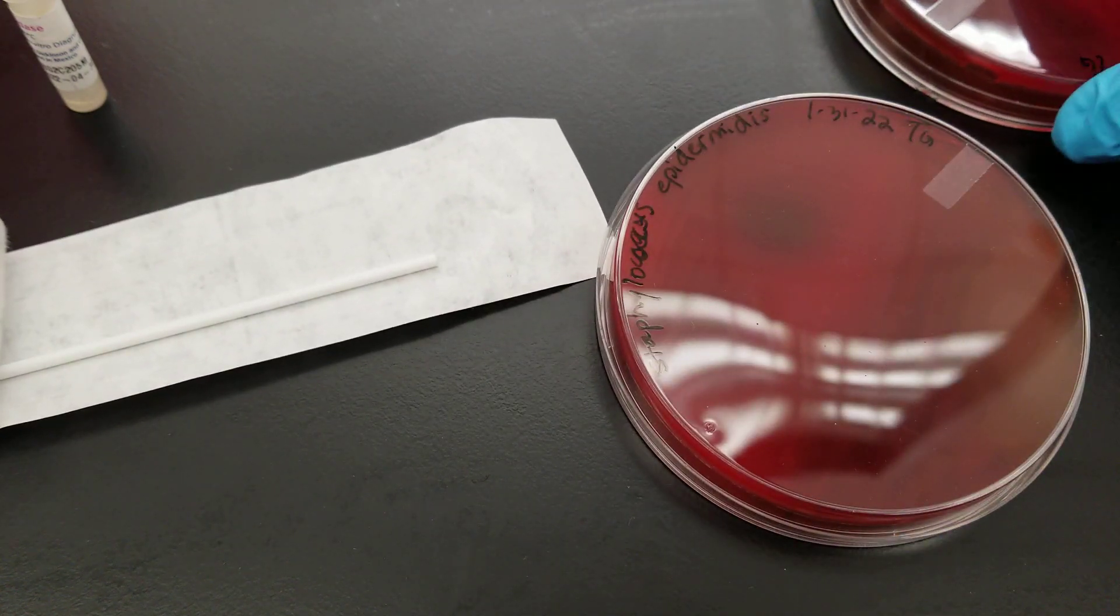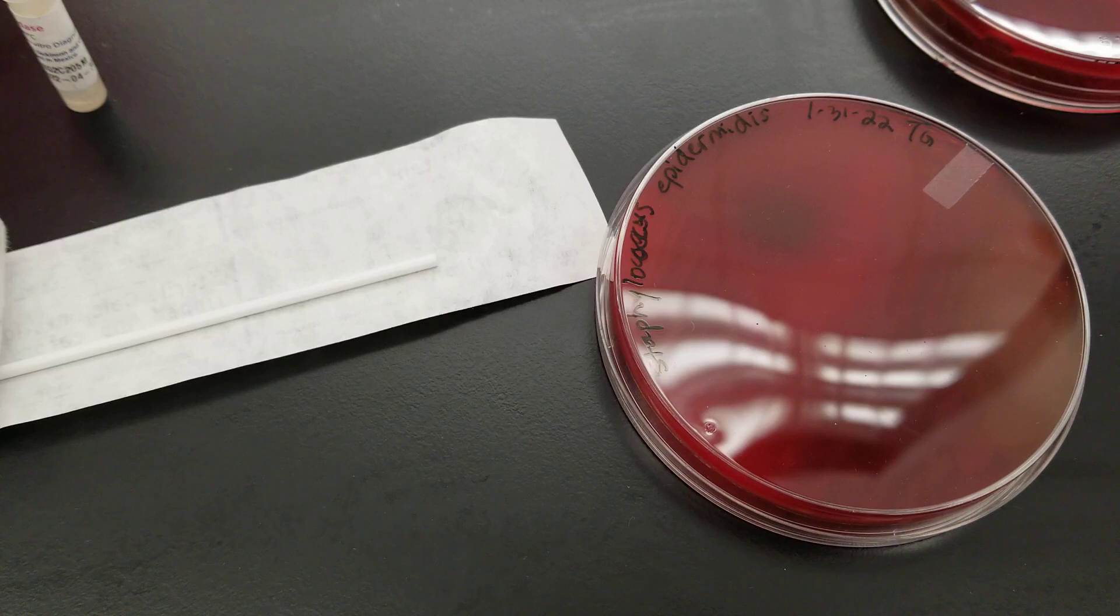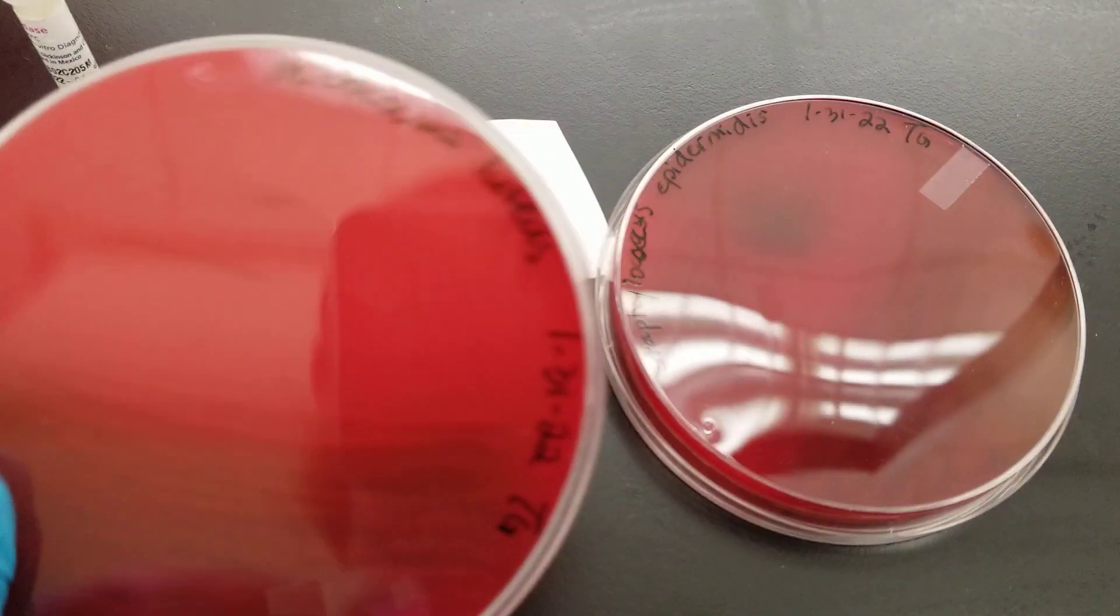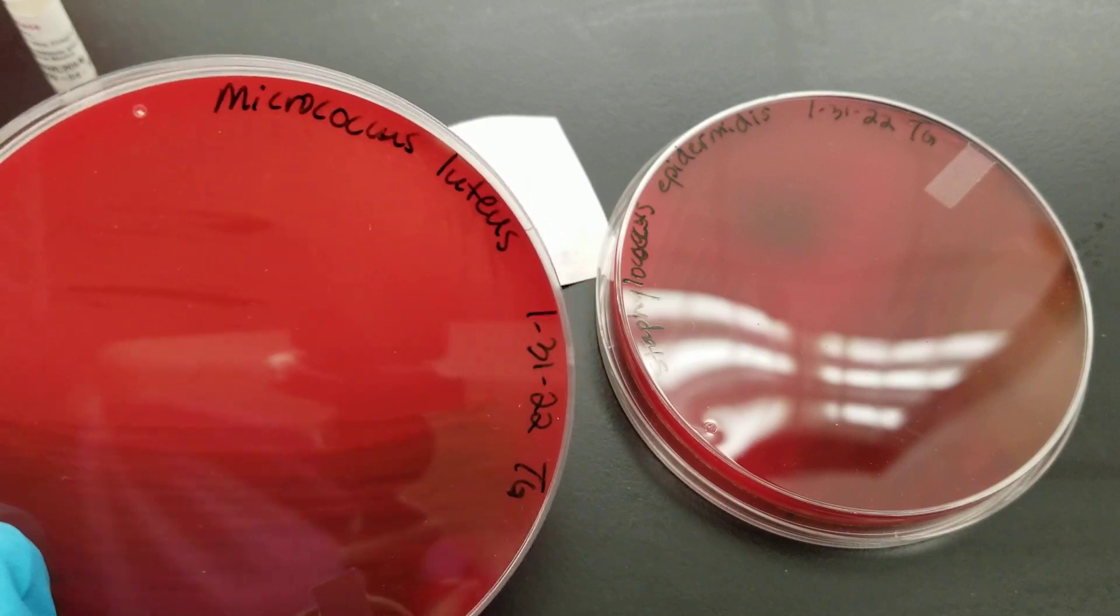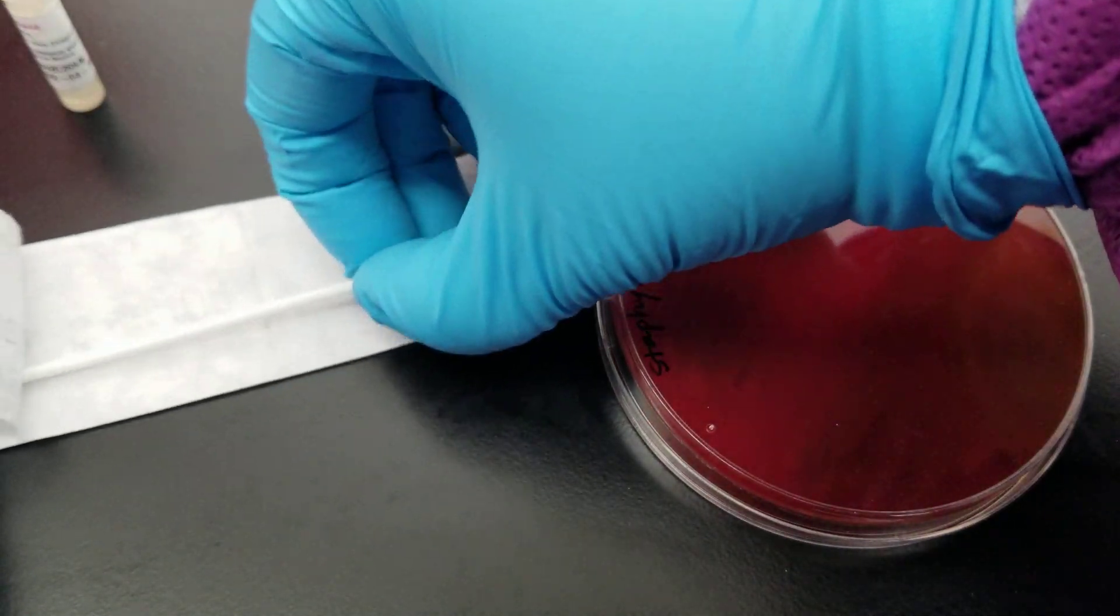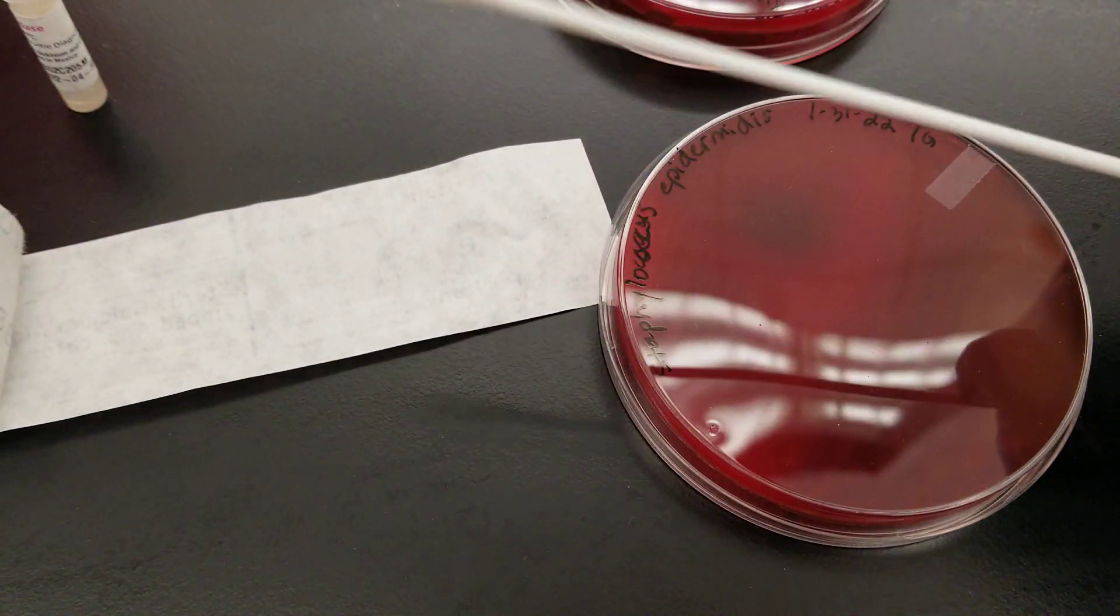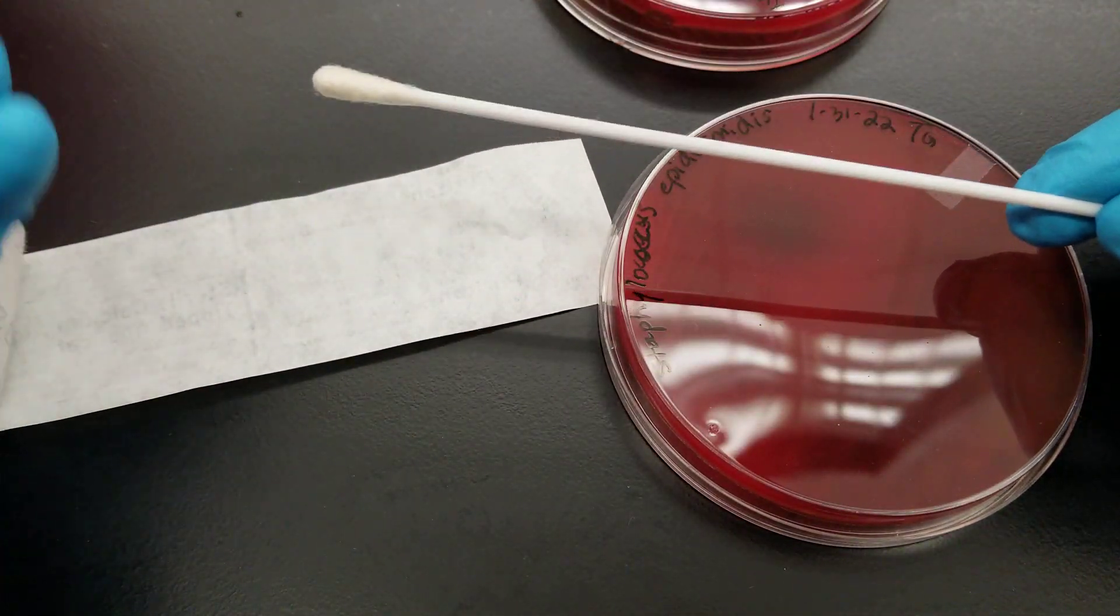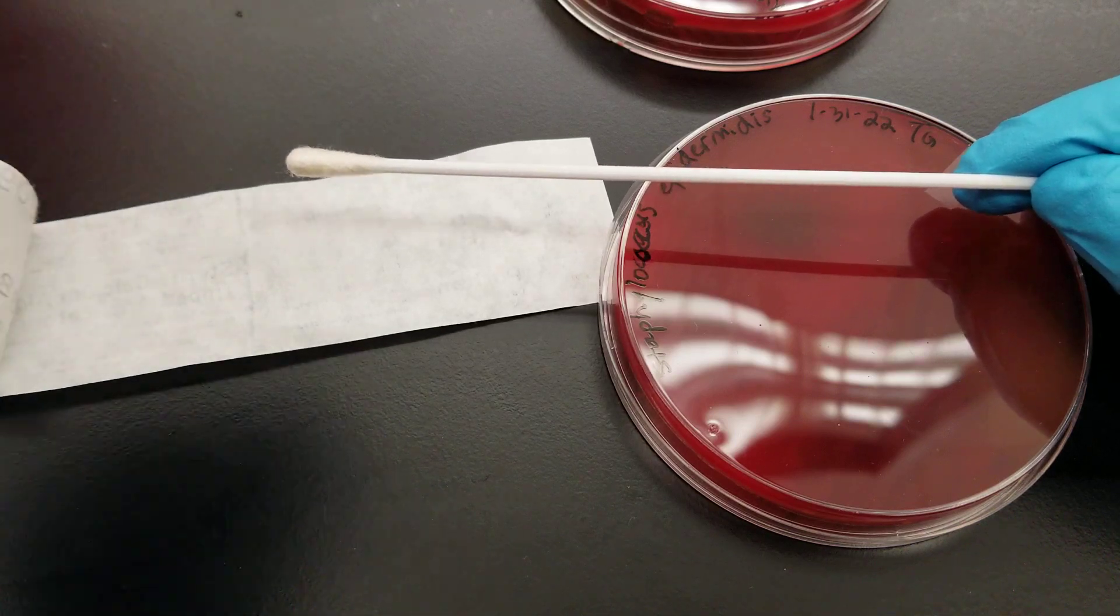This is staphylococcus epidermidis. When we do our testing flow chart, it ends up being between micrococcus luteus and staphylococcus epidermidis, and this is a way to differentiate them. So we'll do this again. We're going to saturate the tip of the swab.